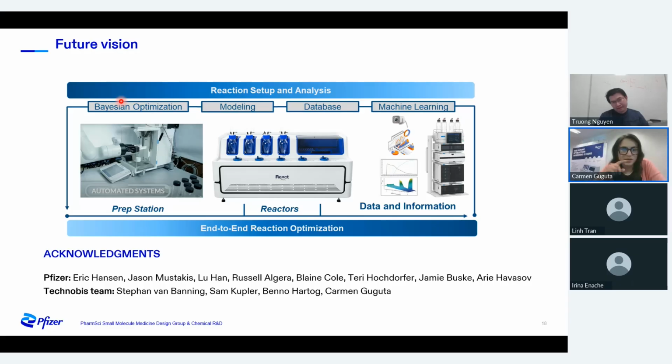The same person or somebody else is asking how the sample line is cleaned in between sampling. With these rinse steps, the rinse goes through the lines, but nitrogen is also purged through the lines to dry them, because you don't want to have your rinse solvent in your next sample.